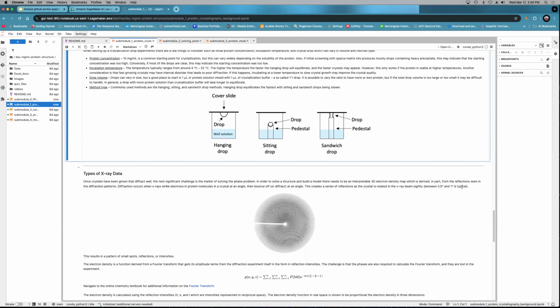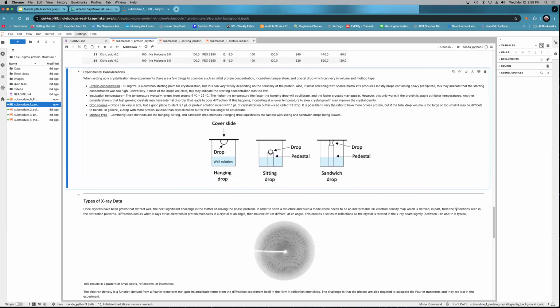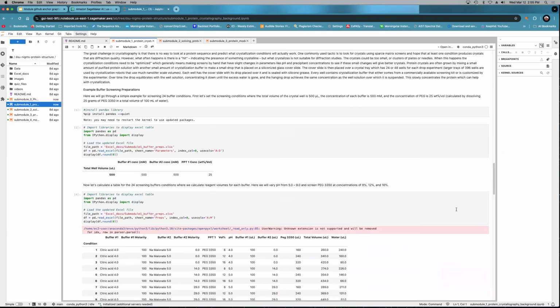They're using the same screening kits, probably the same conditions, but one person just has better luck at crystallizing things than another. It's kind of an art, but it is also related to technique and skill and just being patient. And sometimes you just have to keep trying things until something works. Some proteins won't crystallize at all either, which is immensely frustrating, but at least that is often not the case with smaller proteins that are soluble and can be crystallized.